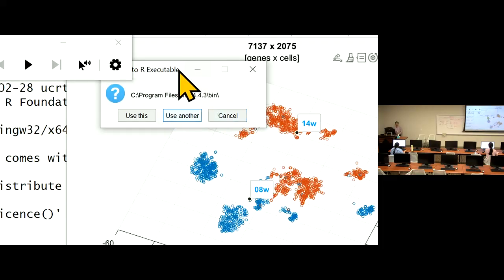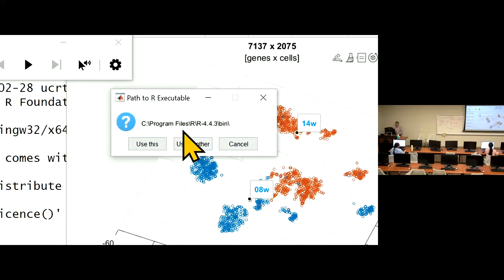Okay, so I point to here. You got lost. You don't have that. So in here, it would be on the tools. Yeah, you can. No, it's not from here. It's from within the MATLAB. Okay. The tool, yes. Yeah, then you can do this directly here. Yeah, oh, okay. Click.